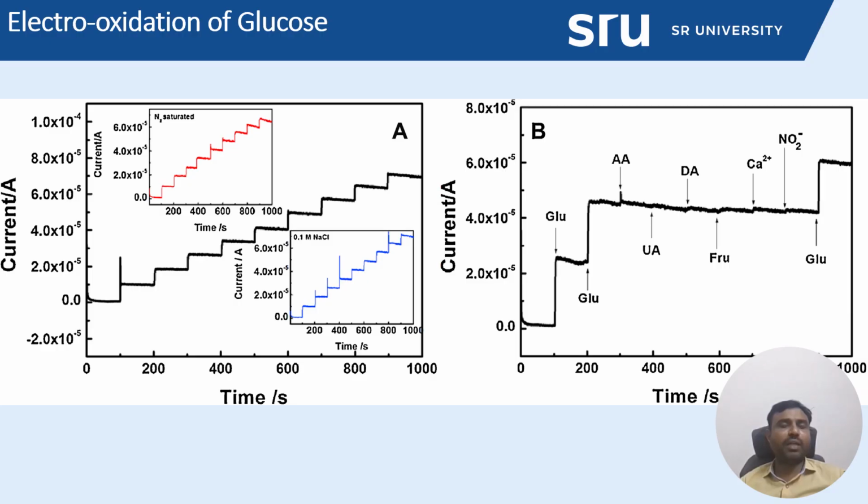It contains only the pure 0.1 mole NaCl without any dissolved oxygen. What will happen? We are performing a similar reaction. In order to avoid external oxygen from the air dissolving again into the solution, we are purging slowly.